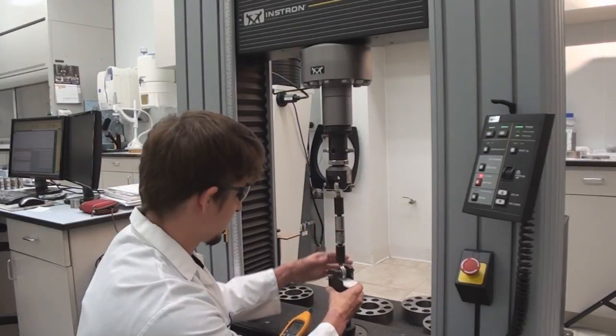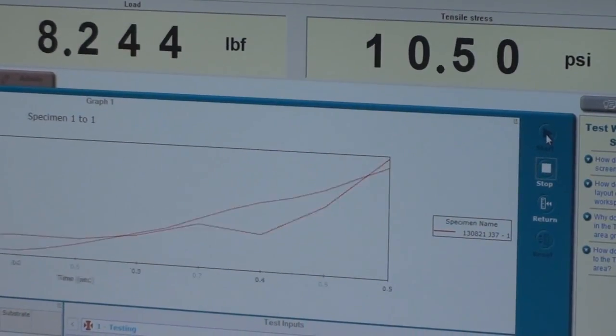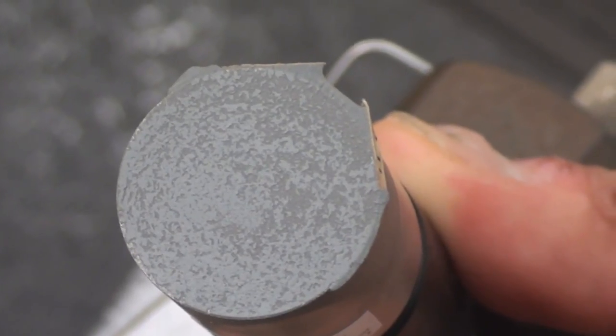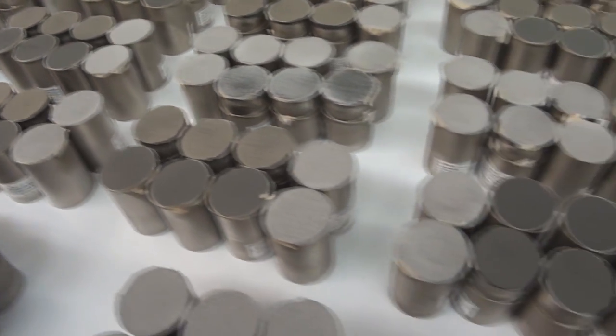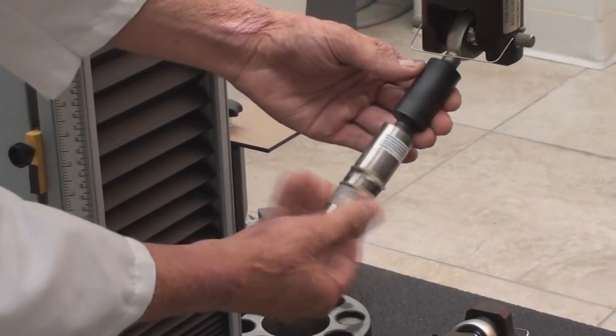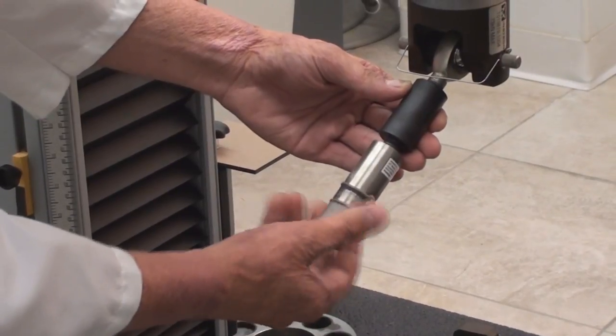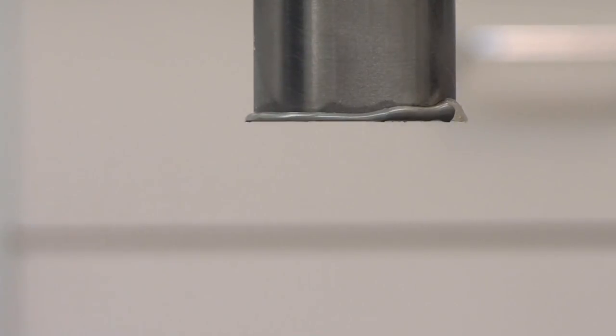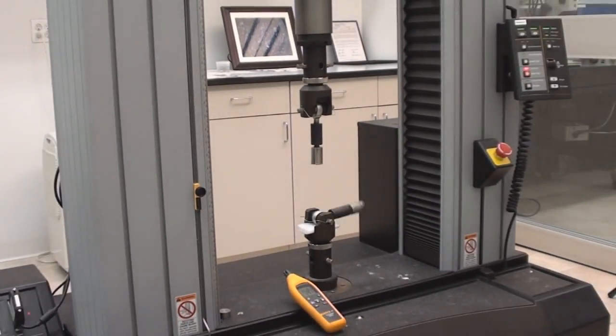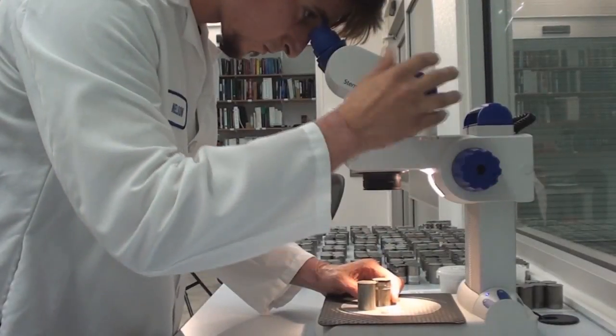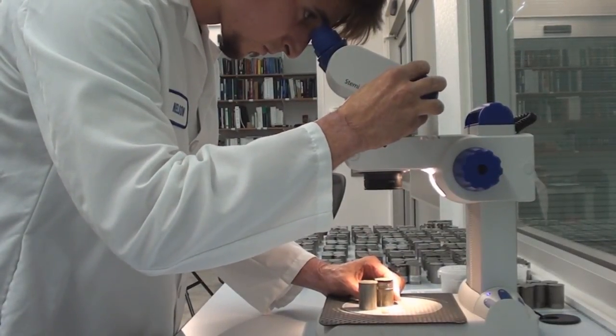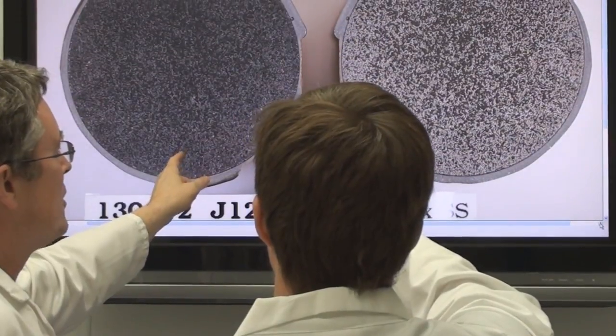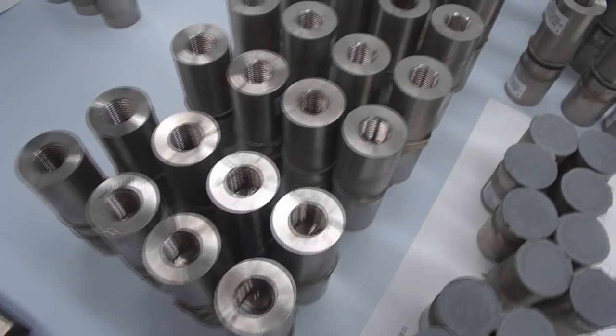The adhesion test allows us to quantify the adhesion strength of a coating to a substrate. A one-inch diameter cylindrical test piece is coated on one side and attached to a load fixture using a high-strength epoxy adhesive. The tensile load is then applied until the point of rupture. This test determines the maximum load force it took to separate the coating from the substrate and/or the epoxy. The result is the minimum adhesion or cohesion strength of a coating to a substrate, that is, unless the epoxy failed before the coating. This is one of the most important quality control tests we perform.